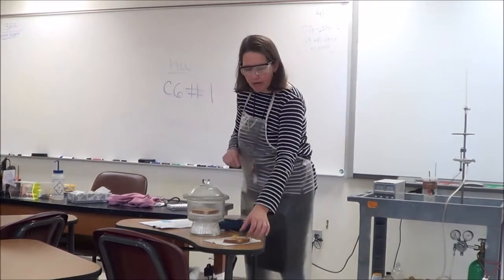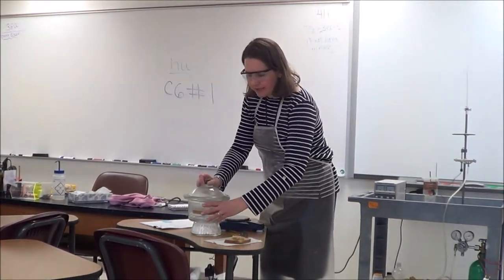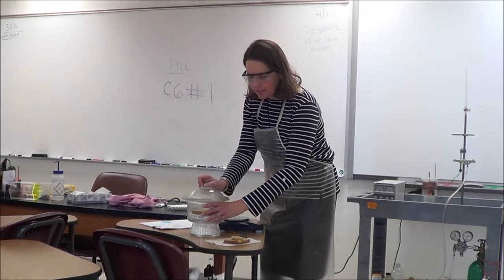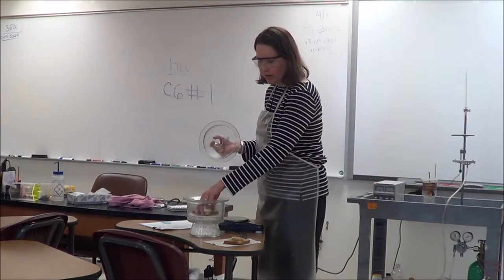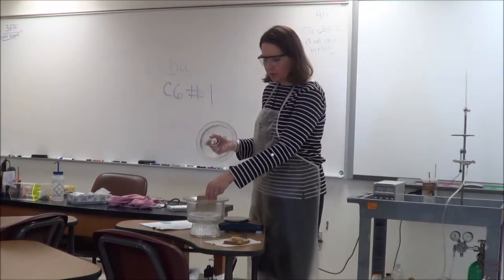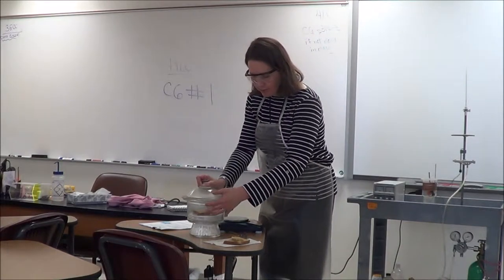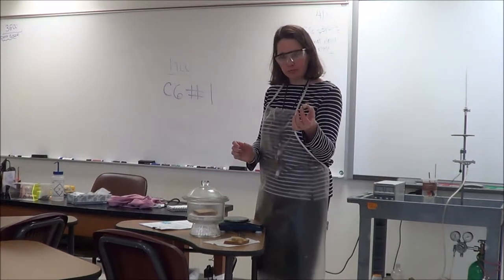The bread we're going to be using has been dry. This is a desiccator, which just contains a substance that absorbs the water, the moisture out of the bread. So it's very much like toast at this point. We'll be using a small amount of bread to burn, this piece right here.